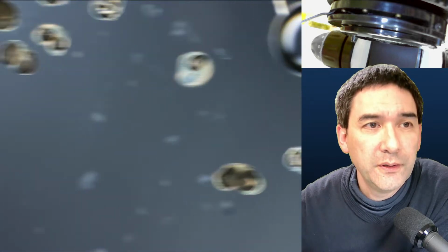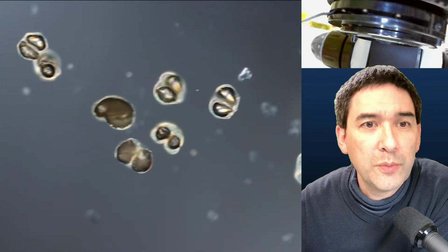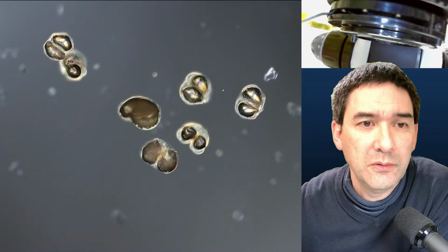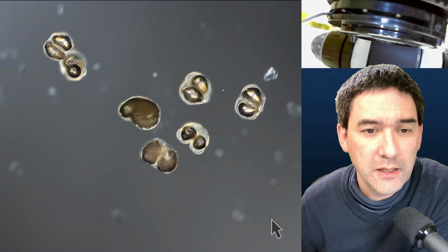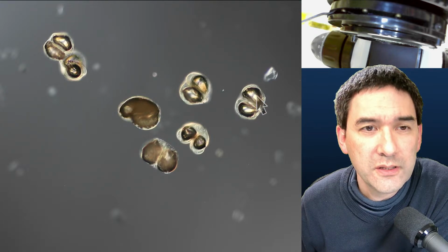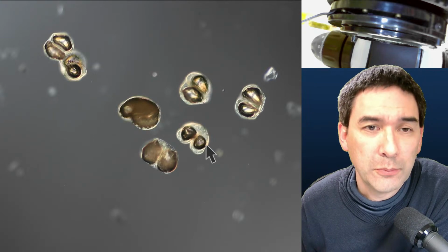Look how different it looks. And what we see here is the following. If you look into the pollen, let me have the arrow over here. Can I move the arrow? I think in here this also looks a little bit like air bubbles. So the mounting medium apparently did not allow for the air to escape properly.